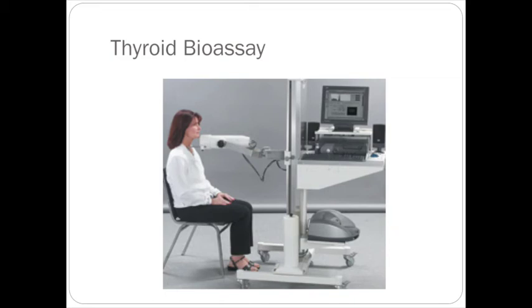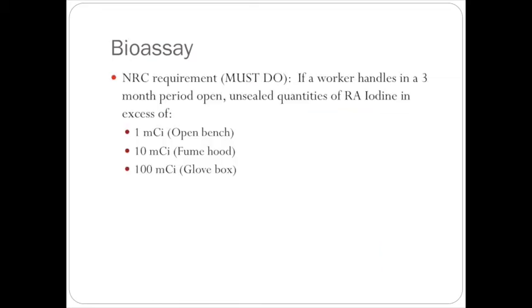So we're going to do something very similar, but as you can see here, we don't use a piece of equipment that's nearly that fancy. You're going to use the same equipment that you use to count your wipe samples and all of that kind of stuff every week in the pharmacy. And it works fine as long as you make sure you set up your equipment correctly.